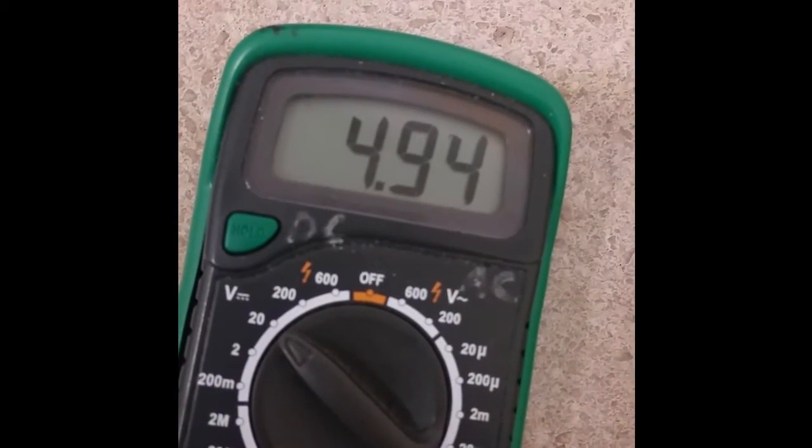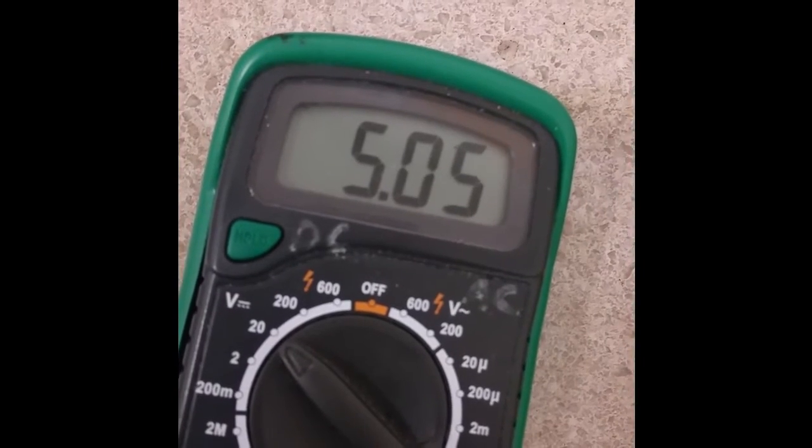I'm touching the terminals and I have about 5 volts, which is solid because that is how the product is advertised — that's what's on the label, anyway.